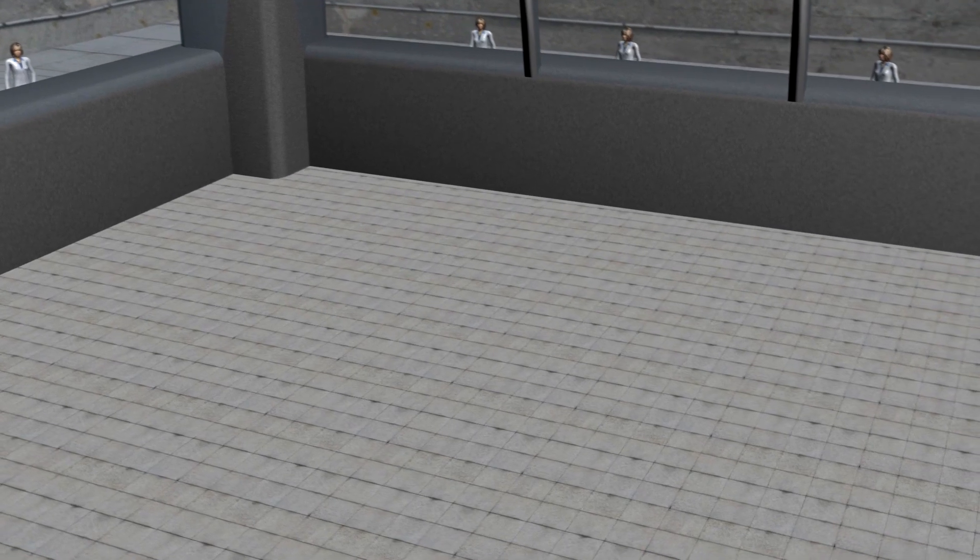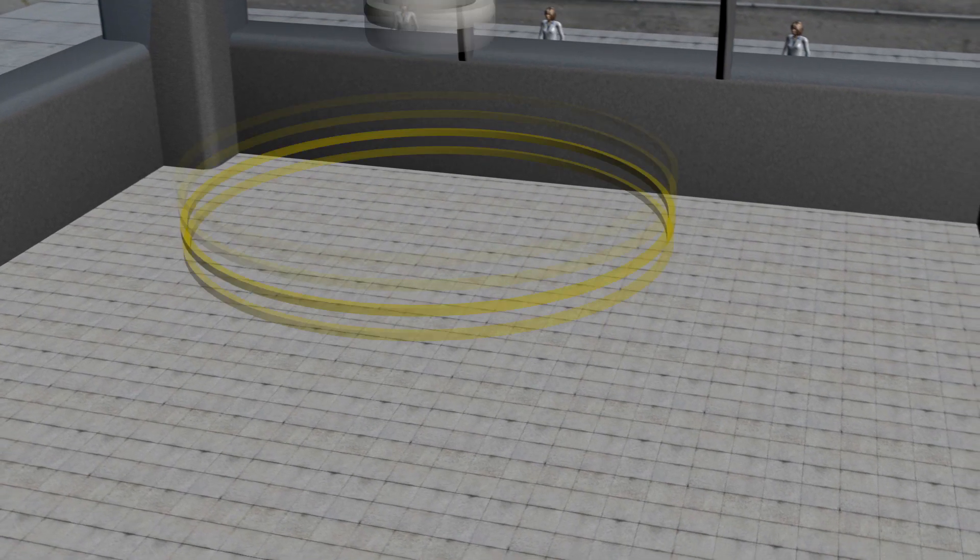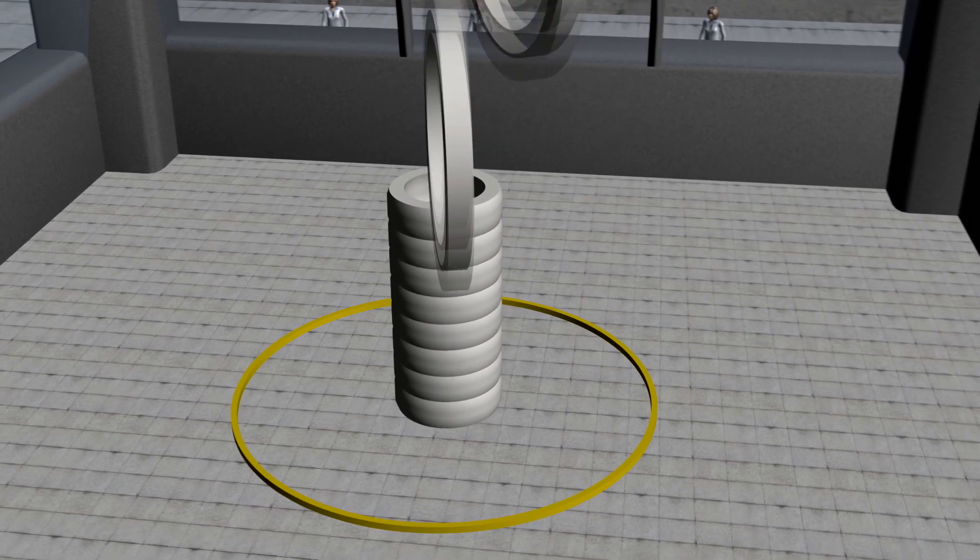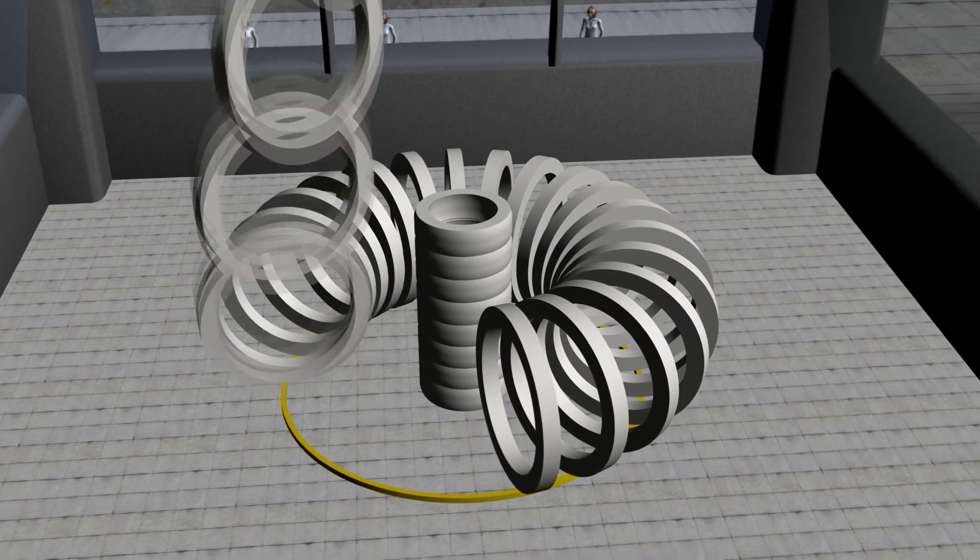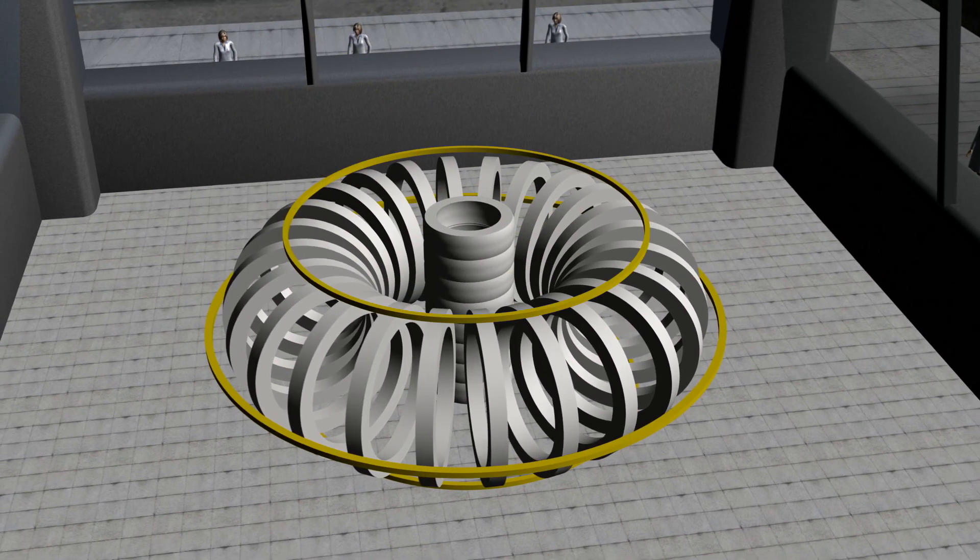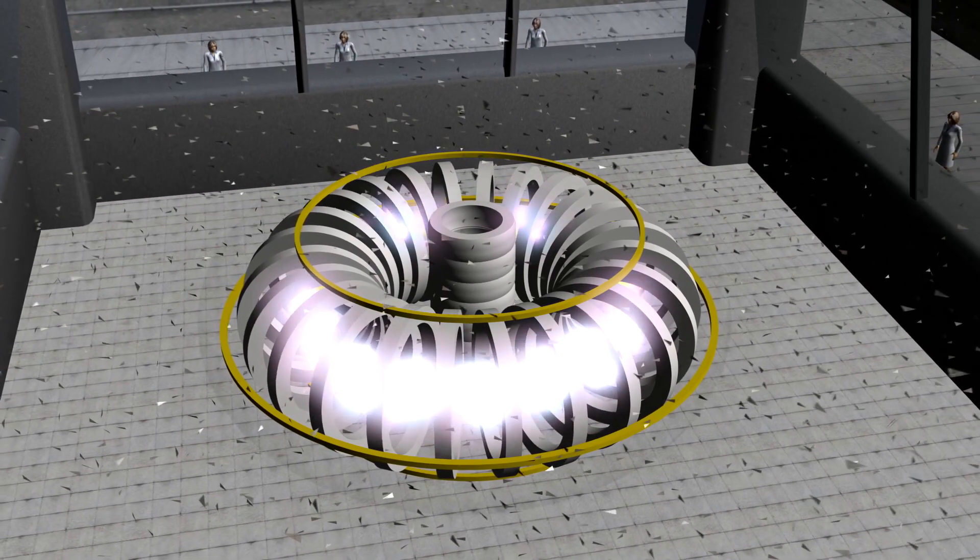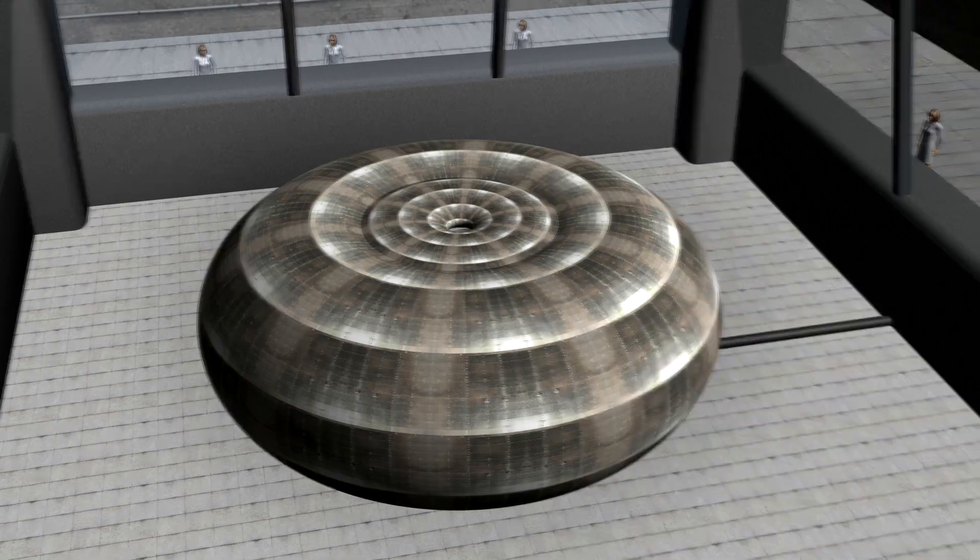The leading scientists of our world are developing a technology that will power the future of mankind. A fusion reactor. But what materials will they use to contain the power of the stars?